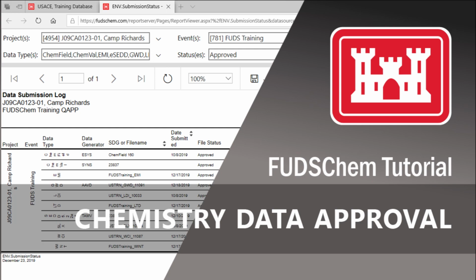This video will go over how to approve chemistry data in FUDSChem, including the electronic data and the validation report PDF. A USACE chemist is always required to approve chemistry data.